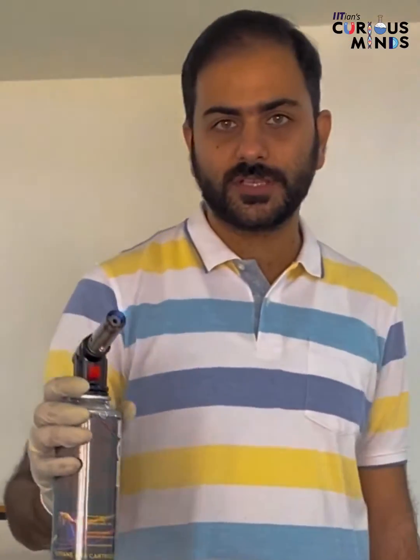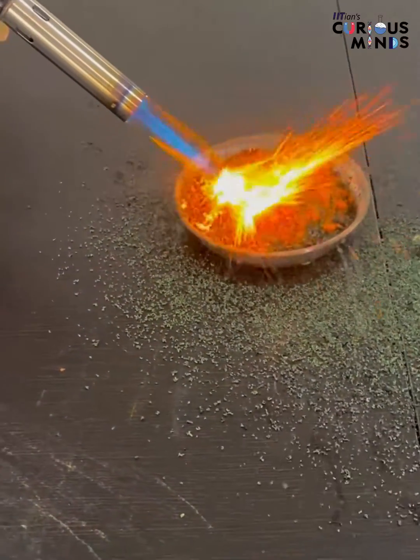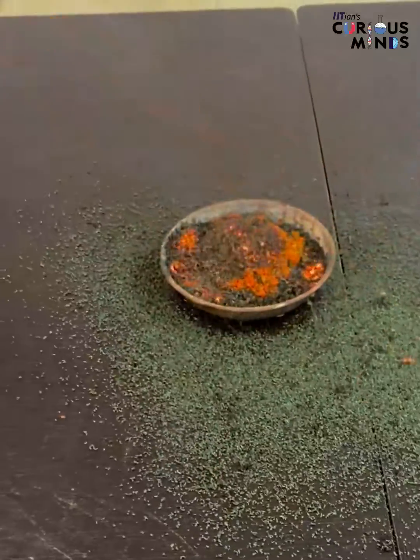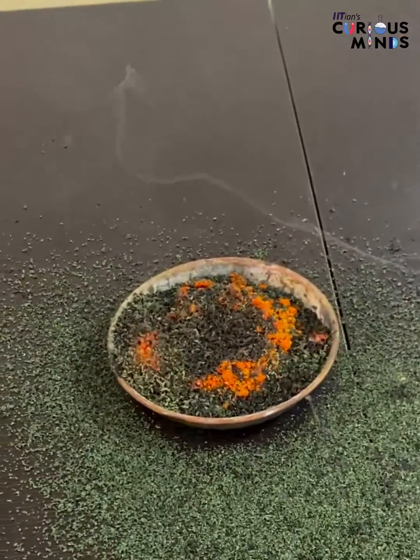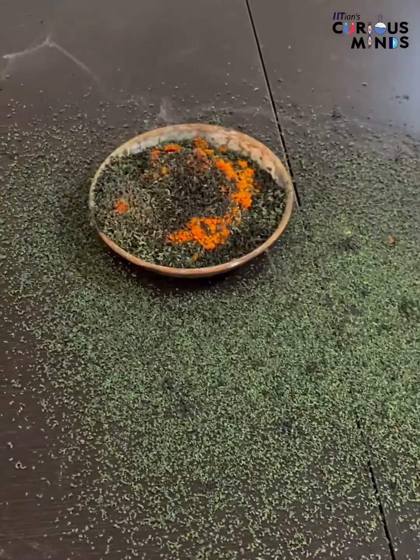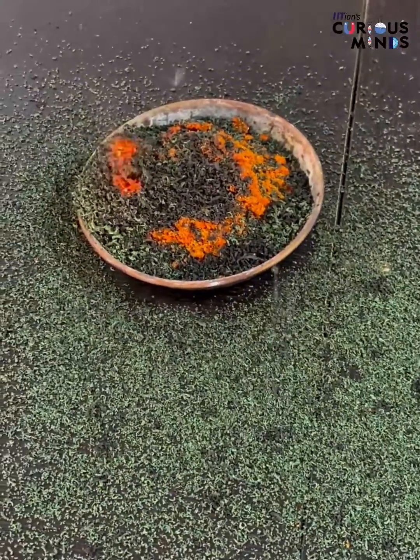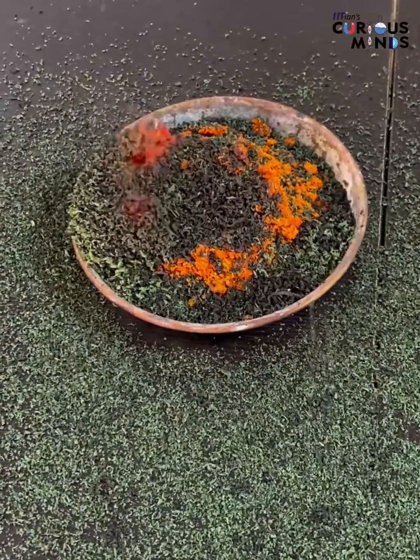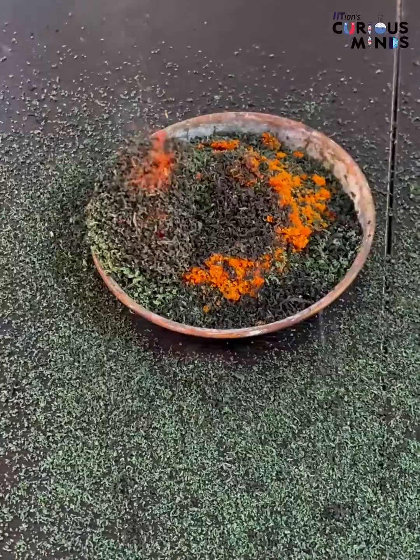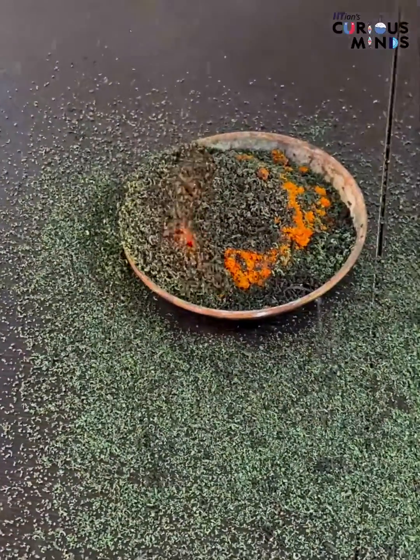Ok dear friends, now using this flame torch I am going to ignite it. Now this looks like a volcano. That is the flame torch. This green colour powder is Cr2O3.